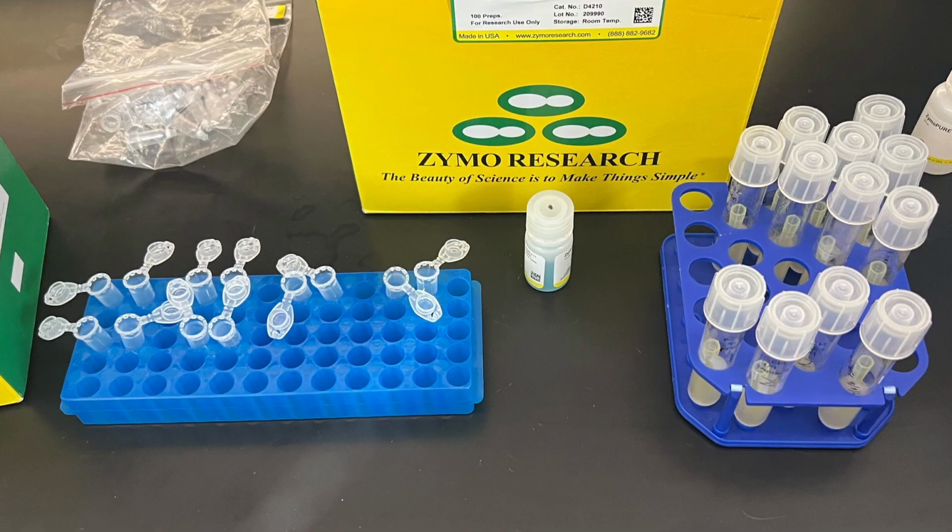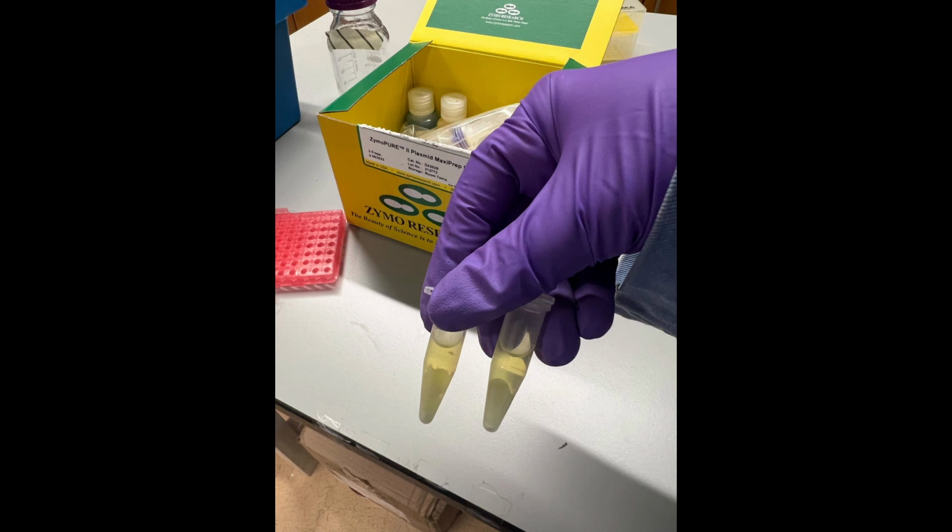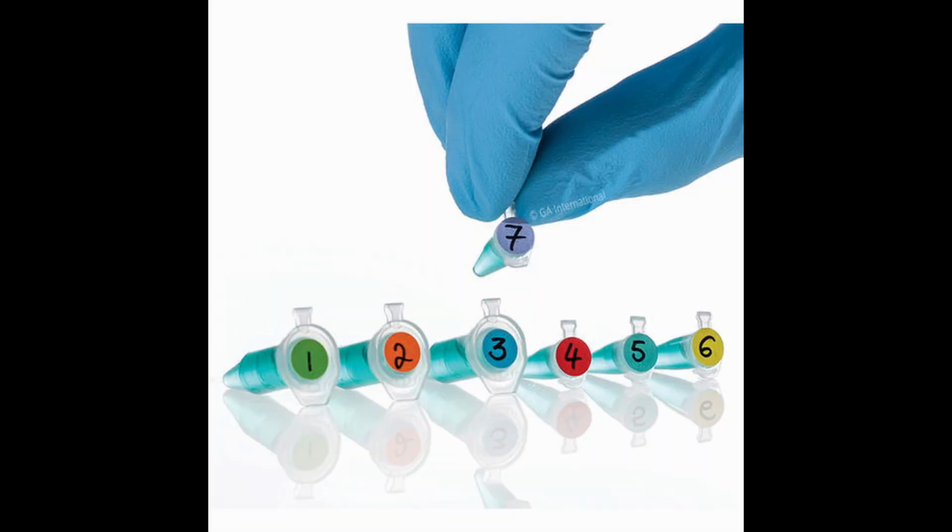Now we centrifuge to pellet the cells. Make sure the centrifuge is balanced so that you do not damage it. We ideally want to use the most cells that the mini-prep is designed to work for, since this means we will purify more plasmid. However, using too many cells is an issue because the lysis buffer will not lyse all the cells and we will end up with a bubbly pellet of cell waste. Also, remember if you're doing multiple mini-preps at the same time to label your microcentrifuge tubes.